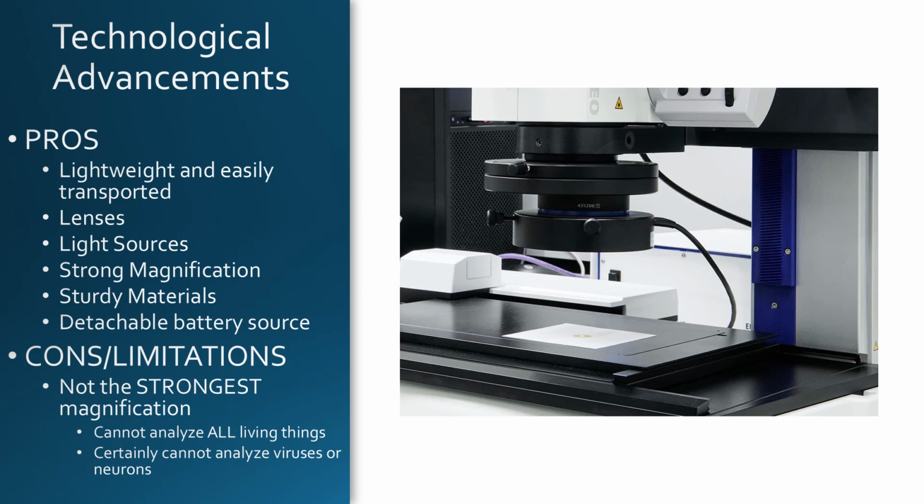As far as the cons and limitations of microscopy as it exists today, there really are very few, if any, drawbacks. It's not the strongest magnification. We certainly cannot analyze all living things, but they are perfect little tools for what we need them for in the lab. So, technological advancements have come a long way.